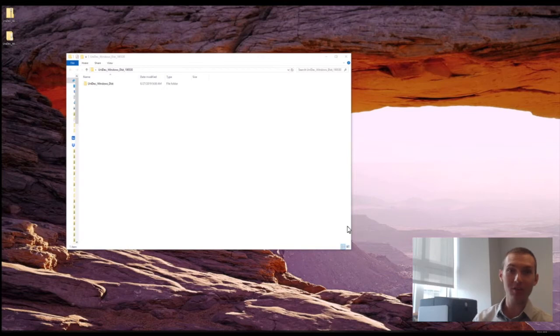It's short for Universal Deconvolution. And it's meant to be a tool to help you analyze electrospray mass spectrometry data. We built it really for native mass spectrometry, but it also works for denatured proteins as well. So why use UniDec? Well, it's totally free. It's very fast. It provides a lot of flexibility in the types of analyses you can do.